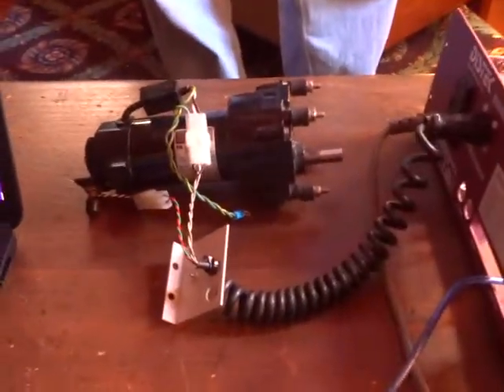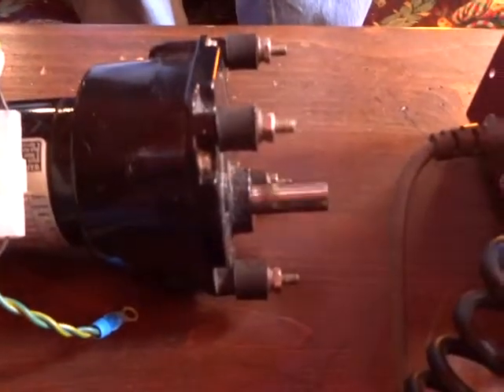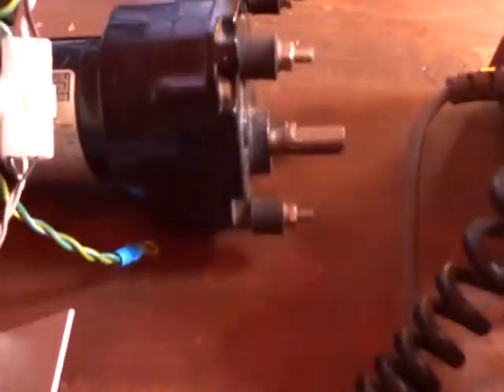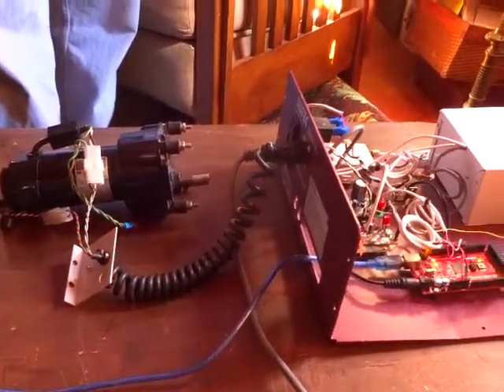So we just changed it. It was at 250 RPM and now it's at 50 RPM. So you can see it changing there nice and smoothly. You can see that it started very cleanly and came up to speed. And so that is the system.